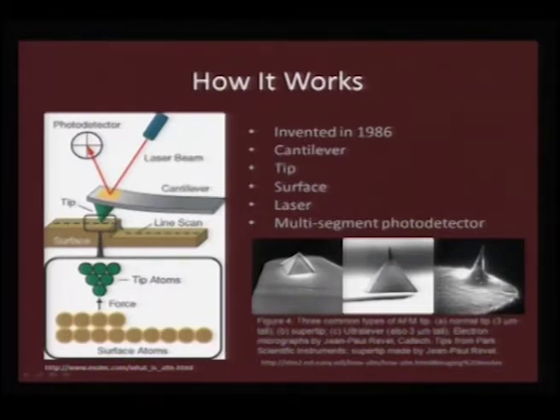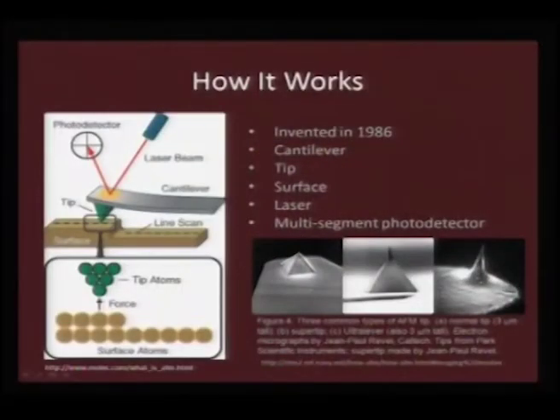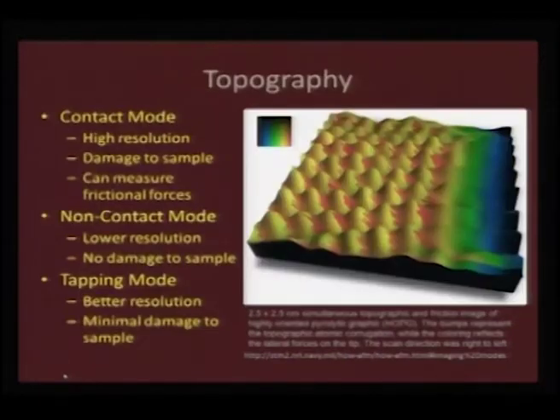So, this gives a luxury for most experimental people to study their materials, especially if they want to look at atomic scale resolution. There are several things that we can talk about. The way the AFM tips are made is also equally important, and it is as challenging a task as that of STM.